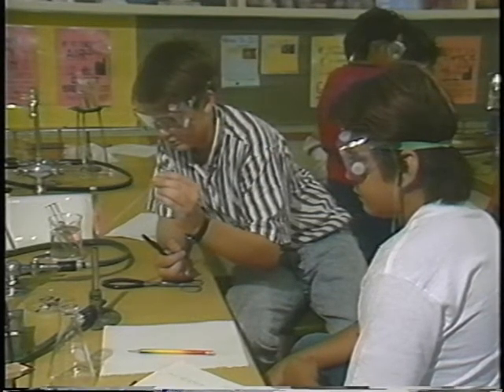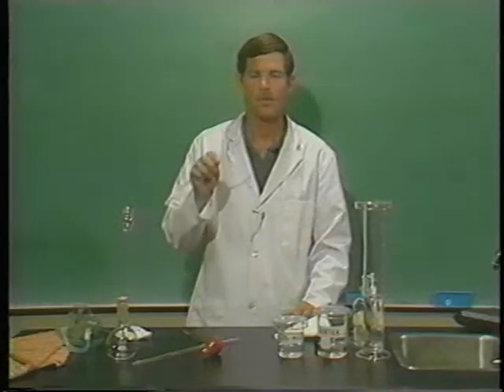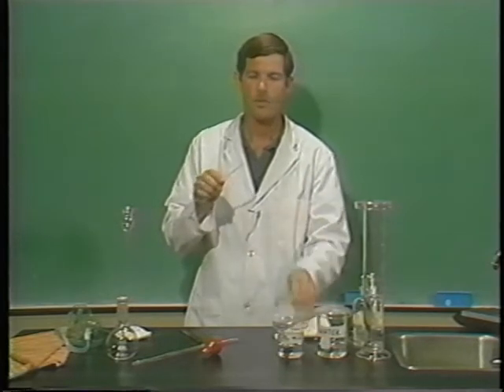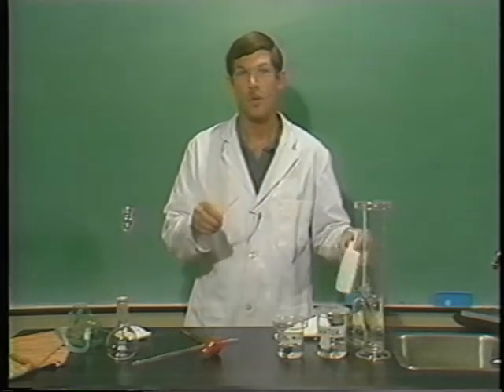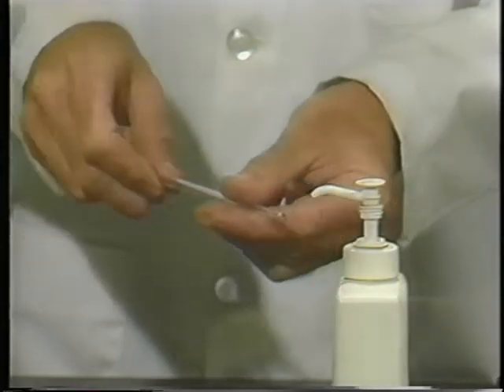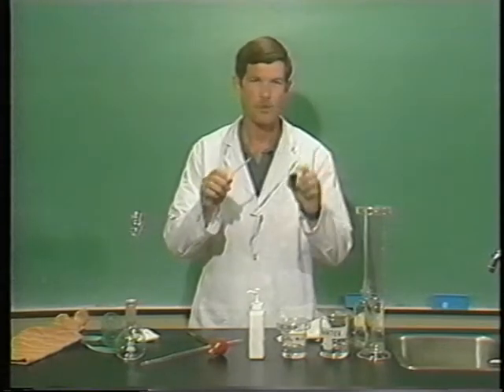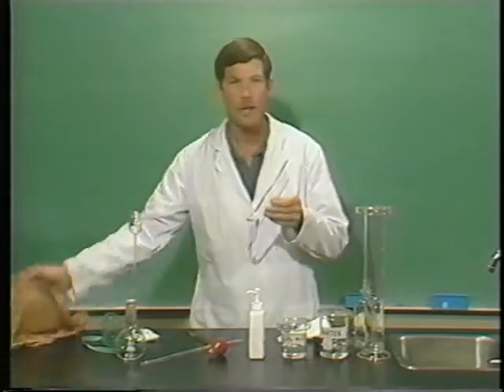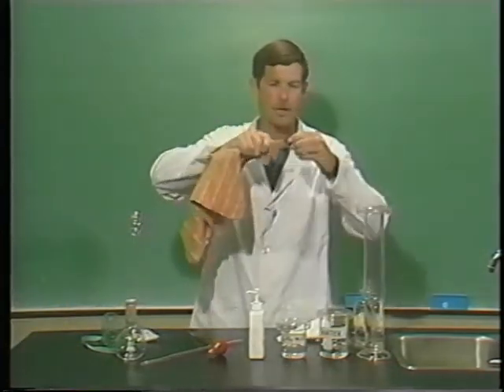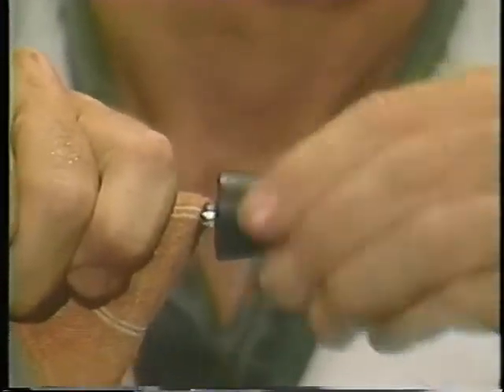Remember that this glass tubing is going to be very hot, so be sure and let it cool off before you touch it. We're now ready to insert this tubing into a rubber stopper. But before we do that, we should make it nice and slippery. You can use water, glycerin, or soap. I'm going to use a little bit of soap. We'll make this nice and slippery here. The next step is to insert this tube into the rubber stopper. But before we do that, we need to grasp it with a piece of towel or cloth and hold it near the base. Then we'll carefully push the stopper with a twisting motion onto the glass tube.